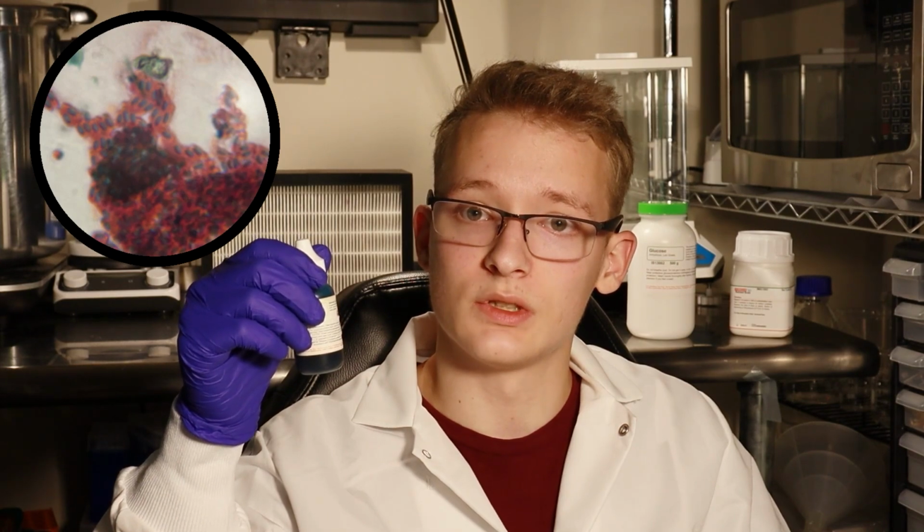Now, if we want to know if they have endospores, we do another stain, called a malachite green stain. This stains the spores green and enlarges them, which allows us to see them under the microscope. Anyway, this is where I ran into my first issue. After reading about the incubation time of Streptomyces online, I found it to be around 72 hours to see isolated colonies.